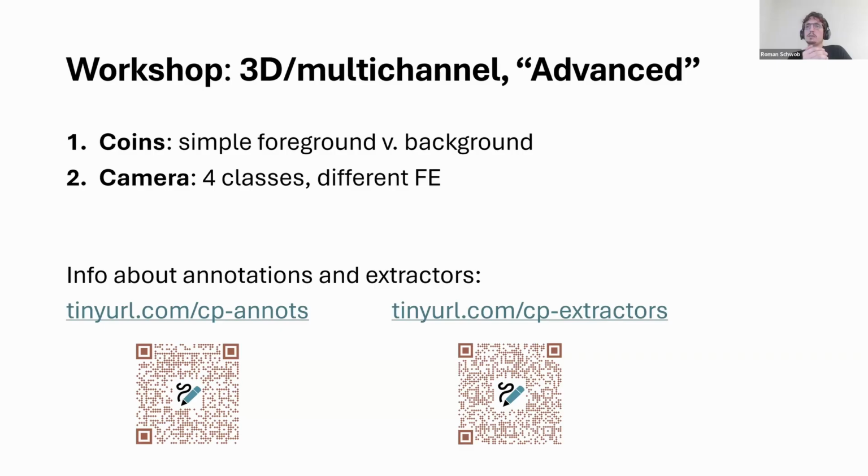And we believe that the best is not even to have a fixed one, but actually to be able to choose the one that suits your task the best. And this is what we did with Convpaint. I hope that explained more or less what you were asking. I don't know what you exactly referred to with boosting.